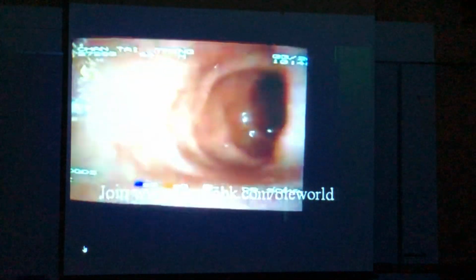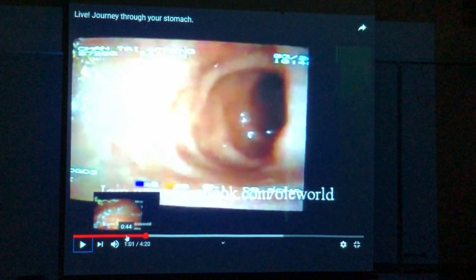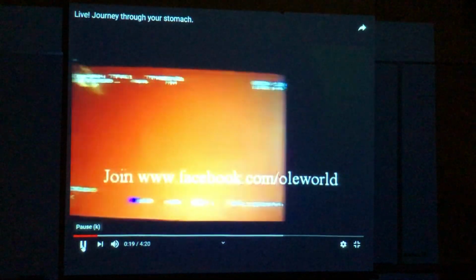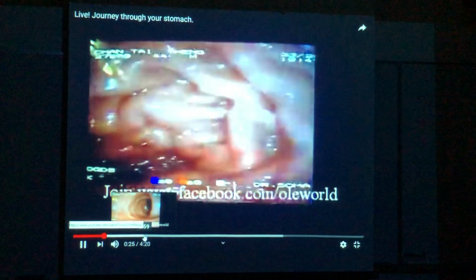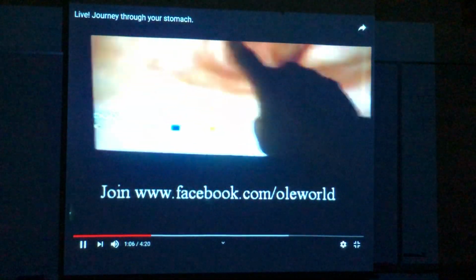But if you look right there, look at that image for a second. Look at the little teeny pleats we have, these little teeny folds, compared to if we go back here just for a second, to right there. See, those are way more pronounced. So I can even tell what part of the intestine I'm in based upon that pronunciation. That means I'm in the jejunum, and the latter part is more like the duodenum, like right here, due to the lack of those folds.